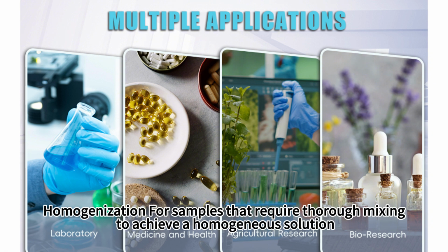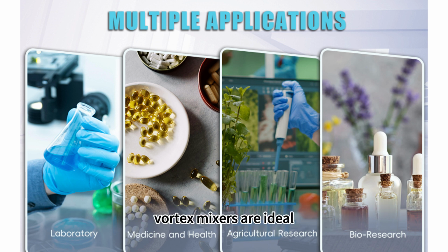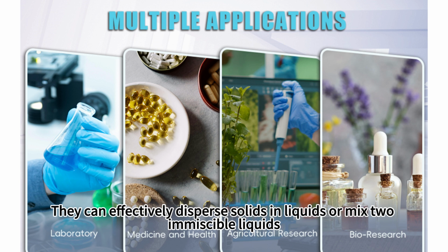Homogenization. For samples that require thorough mixing to achieve a homogeneous solution, vortex mixers are ideal. They can effectively disperse solids in liquids or mix two immiscible liquids.